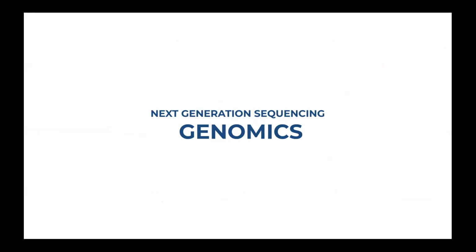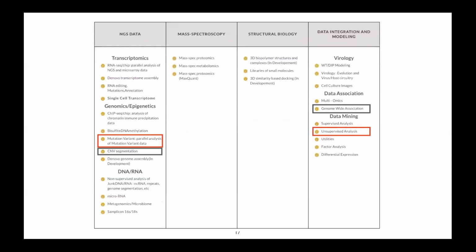Now let's talk about genomics data. Genomic data is different, and we can use a variety of methods to analyze that data. So we'll look briefly at how we can look at individual single nucleotide polymorphisms, or SNPs, or SNVs. So we can look at single nucleotide variation, or we can look at copy number variation. Copy number variation is variation of the number of times that a gene is recorded in the DNA.